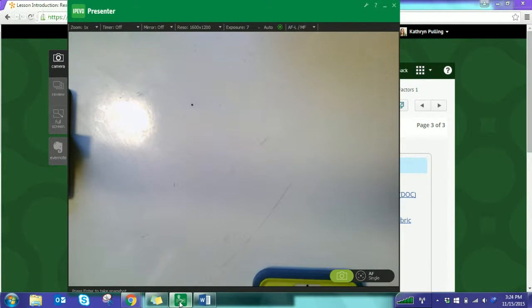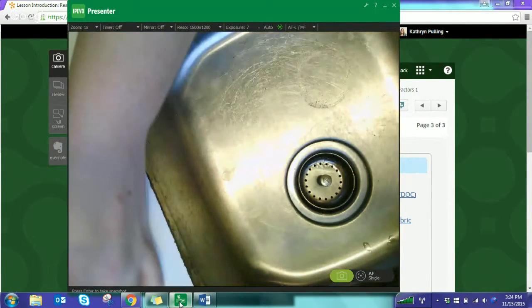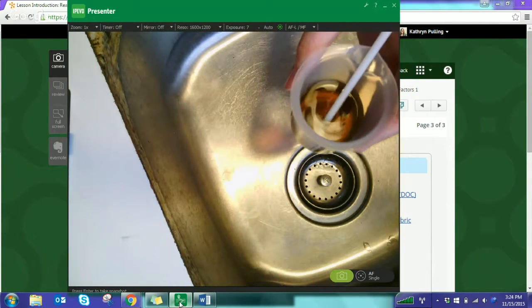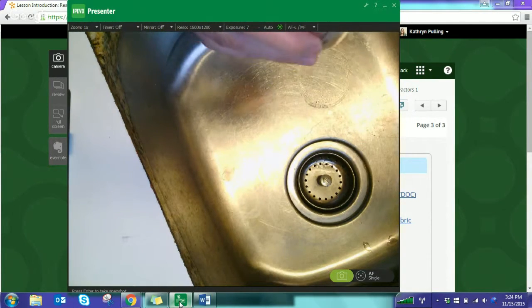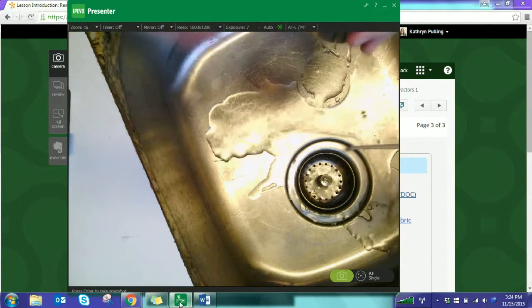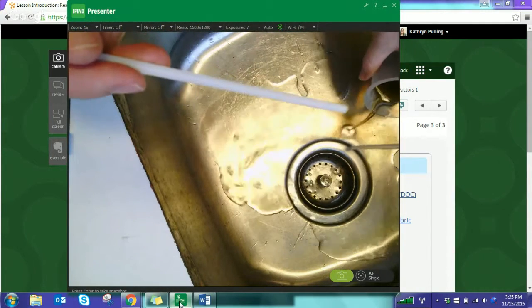So what I need to do now, and this is why I'm working near the sink, everything that was involved in the reaction, so the beaker and the stirring rod, because I don't have enough beakers to have 7 separate ones, nor do I have enough stirring rods. What I'm going to do is I'm going to turn the water on. Alright, you can pour this down the sink, but always pour it with the water running. Alright, that way you're diluting it even more.